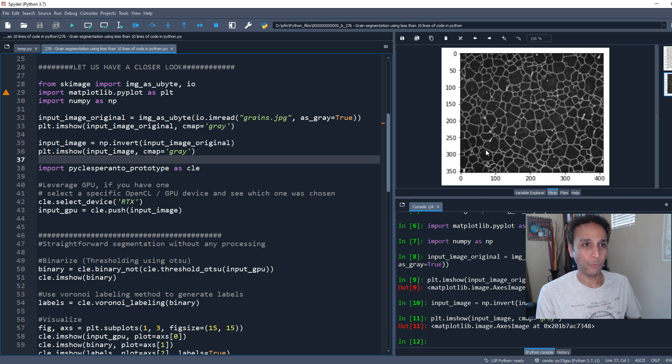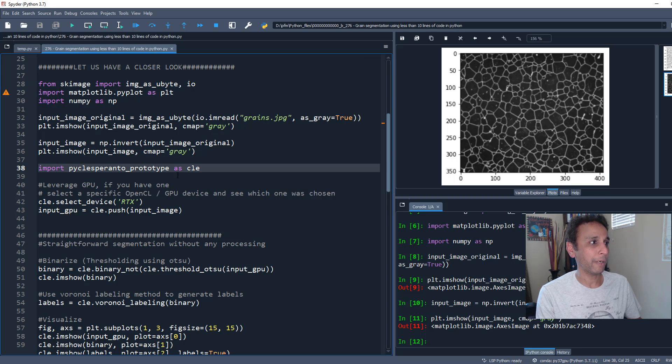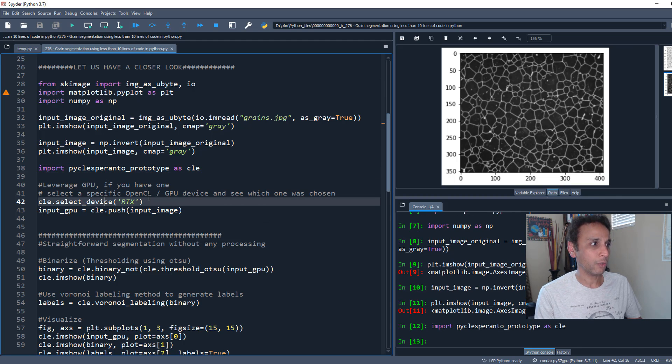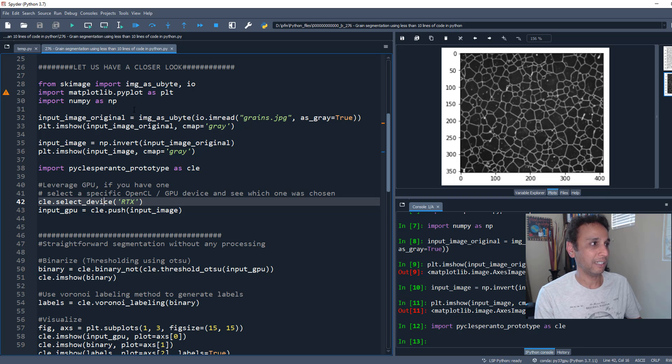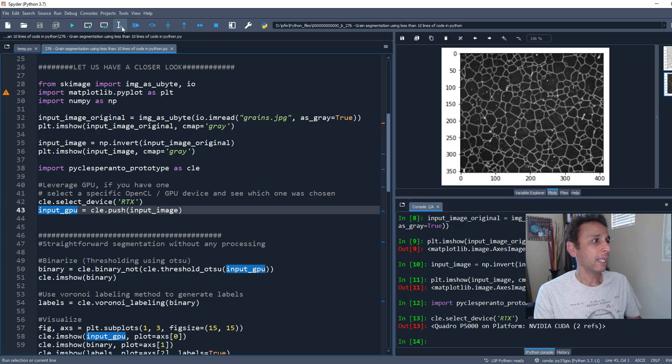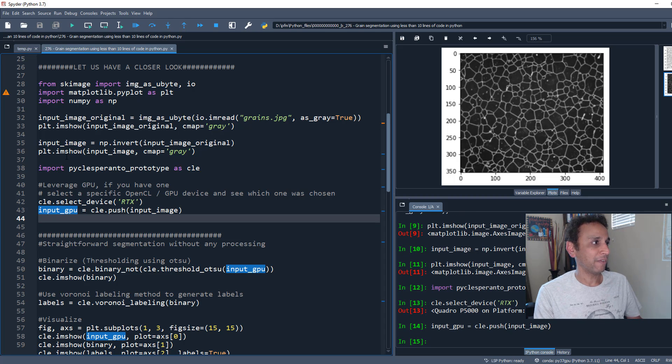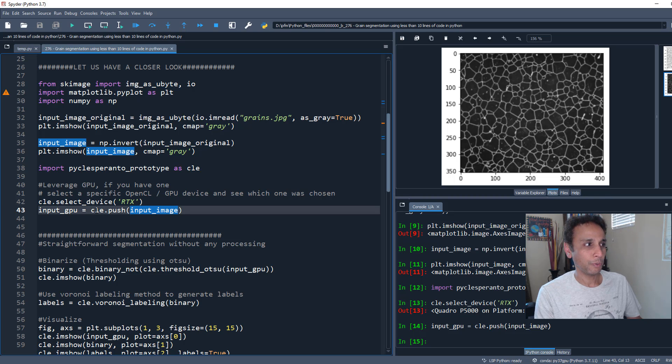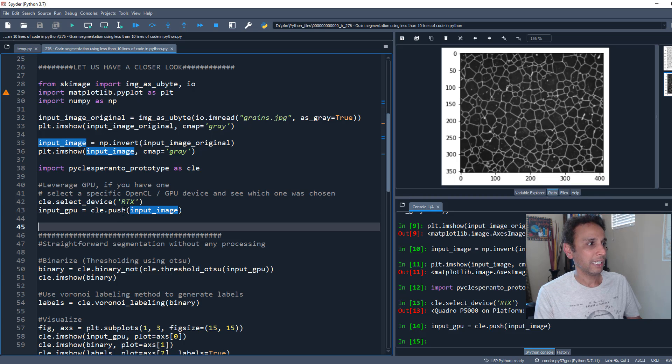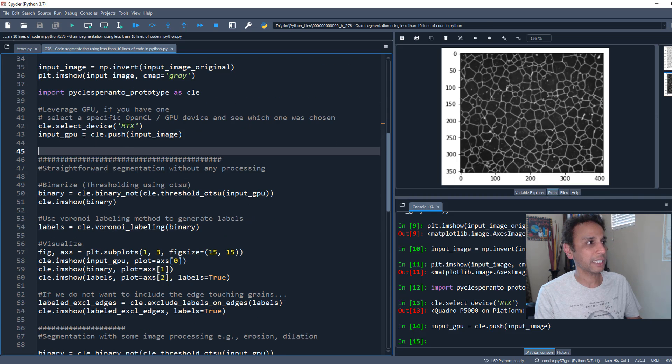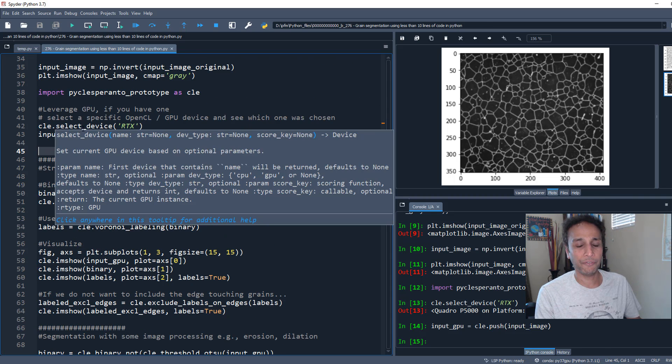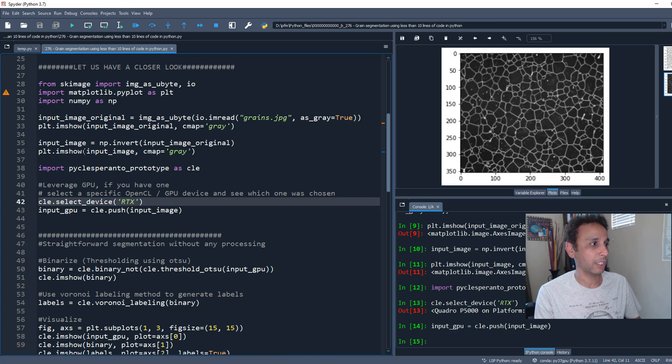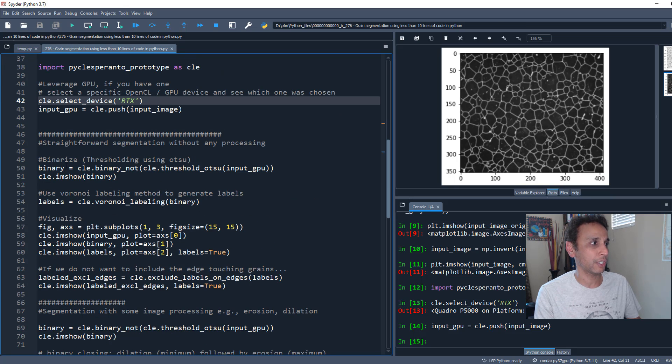In PyClassPeranto, let's load that library and define that we're working on a GPU using select_device. If you don't have a GPU, it'll use CPU. I'm defining my input image and pushing it into PyClassPeranto so it can benefit from the GPU. You can skip these steps if you don't have a GPU.